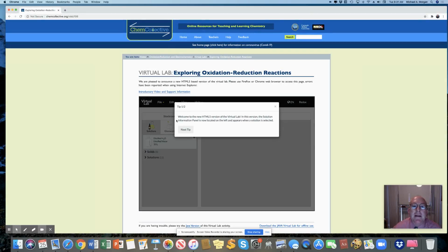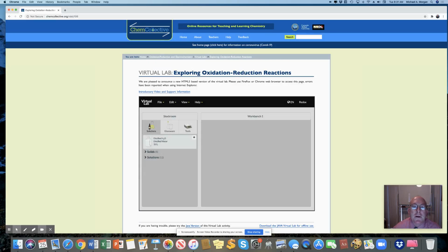Now, there is a set of tips that you can go through and you can watch. I recommend that you do watch those. This is your basic laboratory bench for virtual labs. Now, you're going to need some solutions today. You can click on solutions, you can click on glassware, you can click on tools, okay? The solutions are outlined in the procedure.